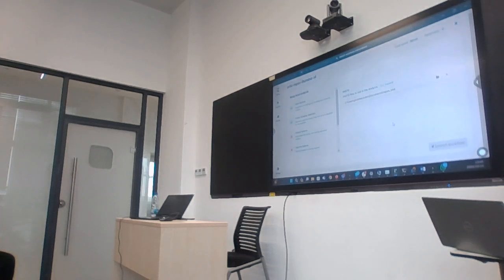Then you want the Mpox 1, the Mpox 1 with just the one sample, okay? Just give me a few minutes. And so go back one level up. The folder. Not the Mpox, where's the Mpox 1 folder? There. And now just click selection on your set.